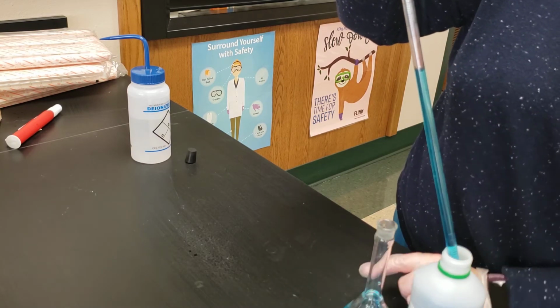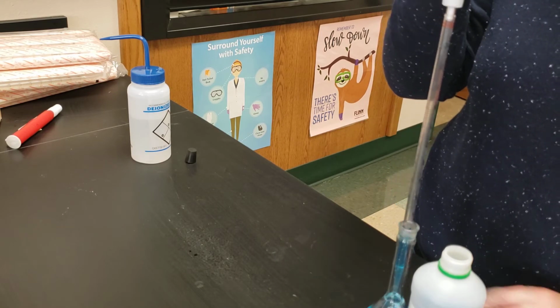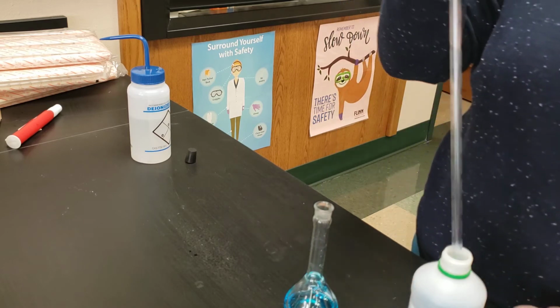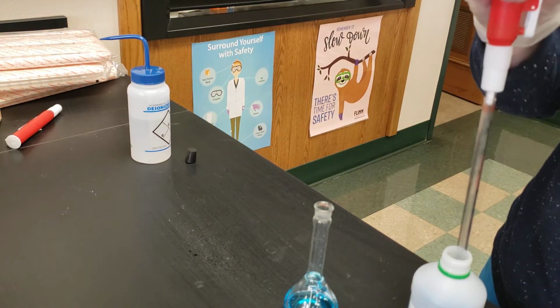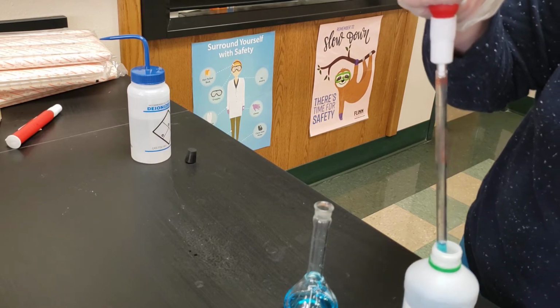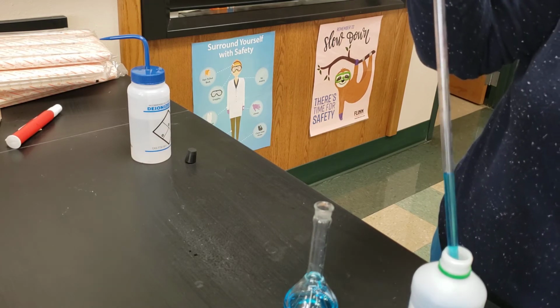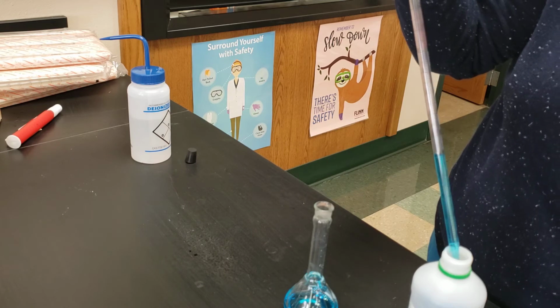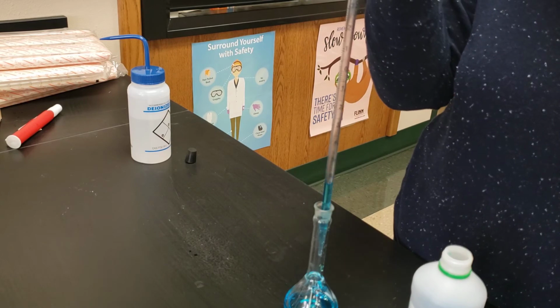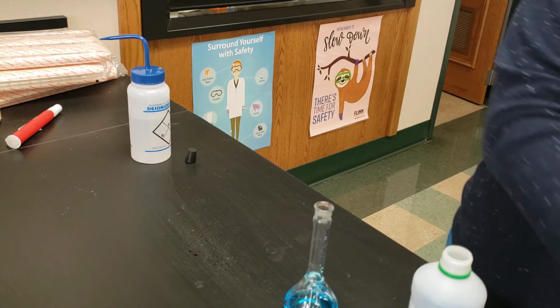I'm going to bring this as close as I can so I don't drip it. Okay. Same thing, roll it down. Fill it up, but this time I'm going to fill it up to the 5 milliliter line. Transfer it over, and then I should be good to go.